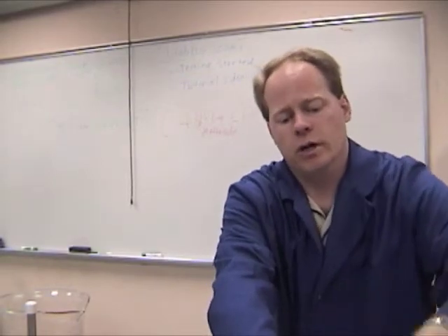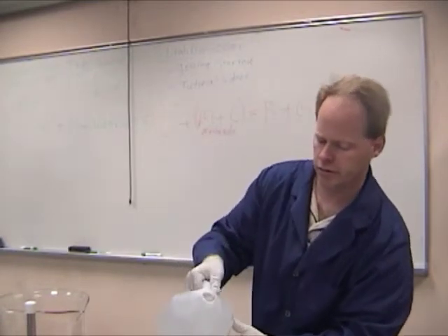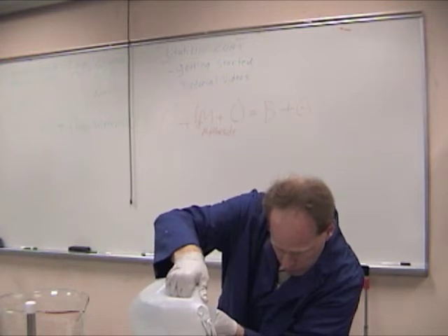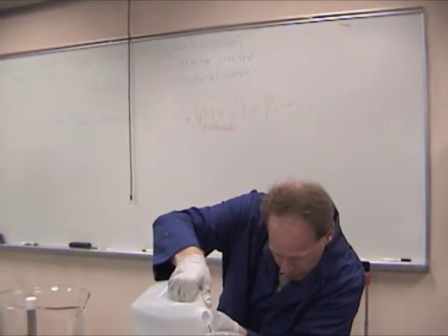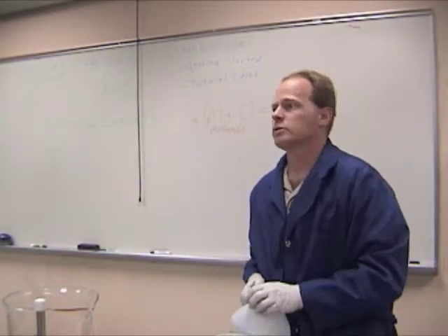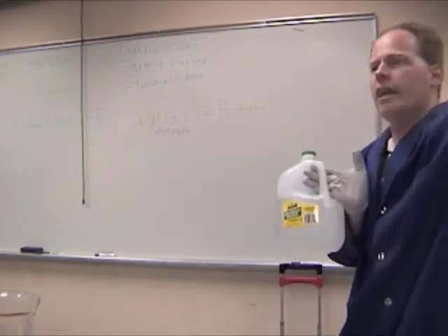I'm going to take some water. This is just a vessel that allows me to measure down to 1 liter. You want to be as accurate as you can with this because we're dealing in such small amounts, and a little bit off at a small amount can be a lot off down the road.